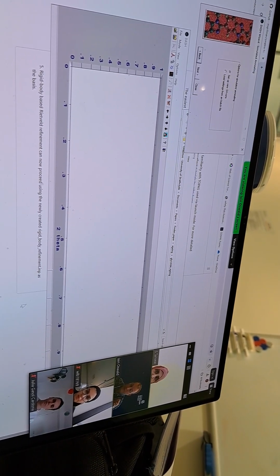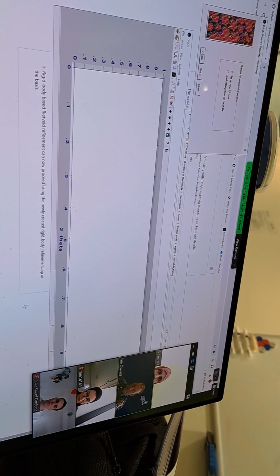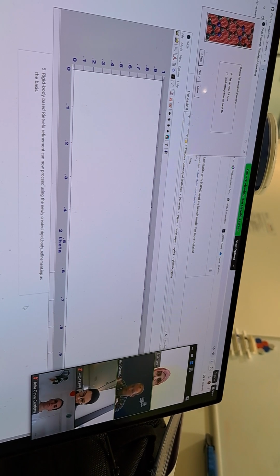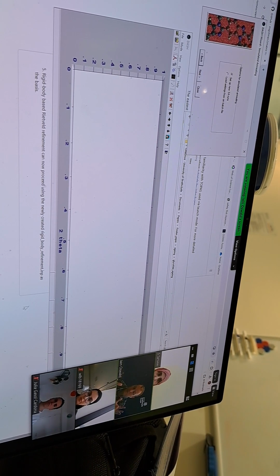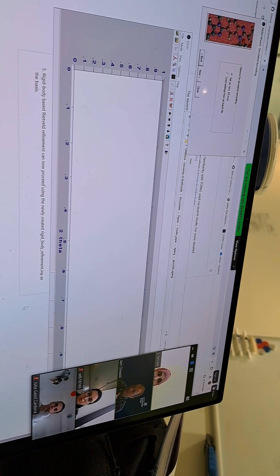These are the bond lengths, these are the bond angles and torsions. The molecule is not going to move away from that, really. There may be a torsional angle, a twisting around a bond, but the bond lengths and angles are going to remain. So please just use this model and fit it as best you can to the data that we've got.